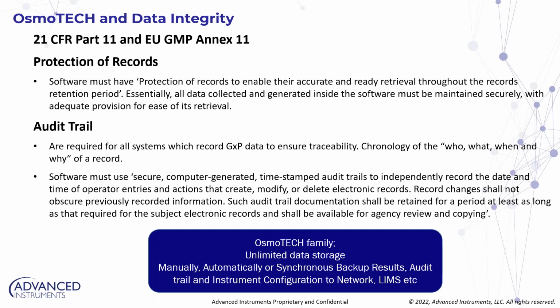And then it will also say why. The instrument is designed to ask the user making the change to give a reason as to why they're making the change. So let's say I give a reason: I'm doing a demonstration for my customer. So I say I'm doing a demo. And now the instrument will also track that it was for demo purposes. So a year from now, when we look at that audit trail, it will say at this time, Shweta logged in, she changed the logout time from 5 to 10 minutes, and she did this because there was a demo involved. And then it will also tell me what time I logged out.